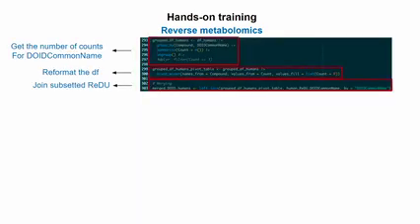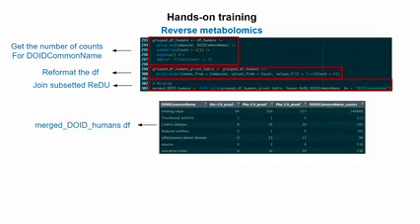So again, when you do the same, you just summarize, you manipulate the table, and then you again link the metadata here. You should then have this first data frame that is generated, where you have the different diseases on the left and the number of counts that are there. But here we want to normalize.